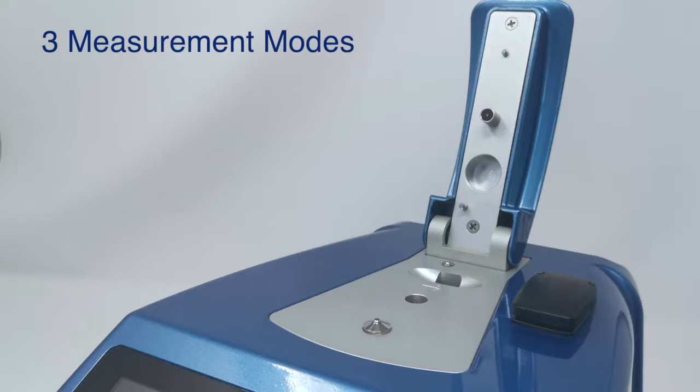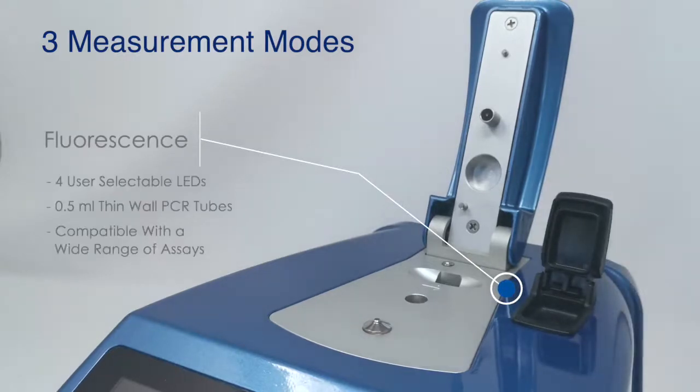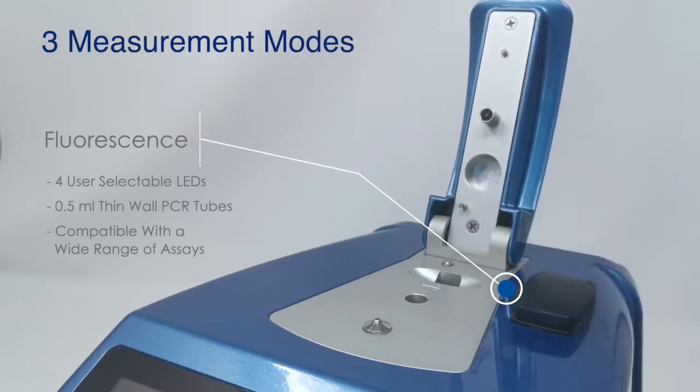Something that's unique to the DS-11 series is we also have an integrated fluorometer. So this fluorometer is a 4-channel fluorescence instrument that measures fluorescence in 0.5 ml thin wall PCR tubes. And we'll talk a little bit more about fluorescence and the importance of it as we go through this presentation.